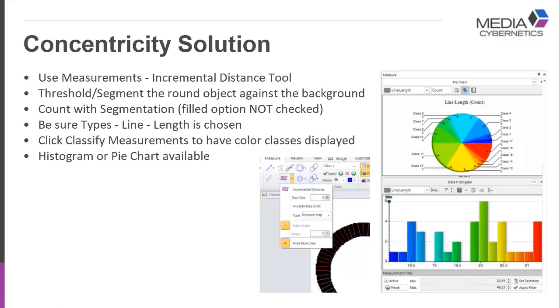In this case, we use smart segmentation or if it's simple enough, we can use basic bright or dark thresholding. After we do a count, it's important that the filled option not be checked.